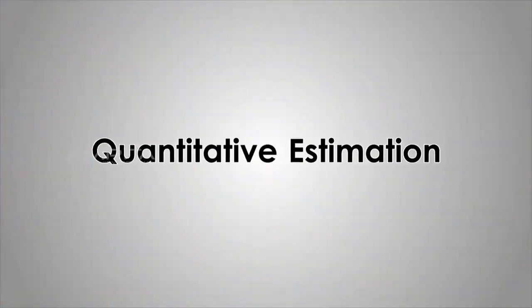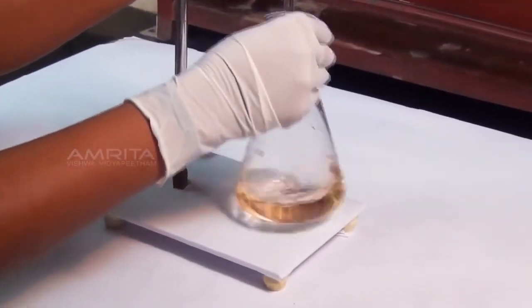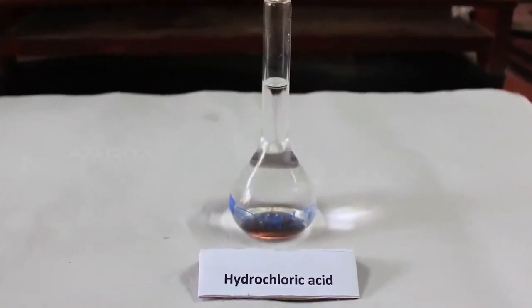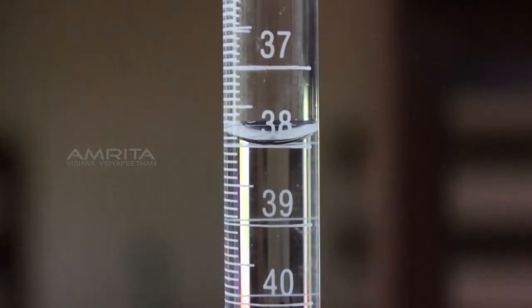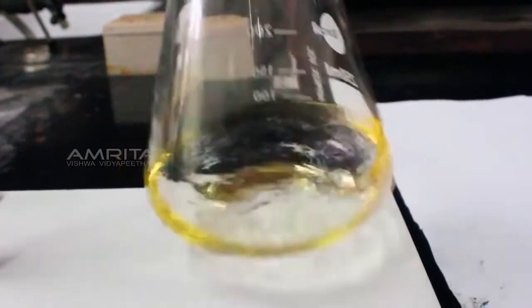Quantitative estimation. Quantitative estimation is a commonly used laboratory technique. It is used to determine the unknown concentration of a sample by measuring its volume. The main process of this analysis is called titration.